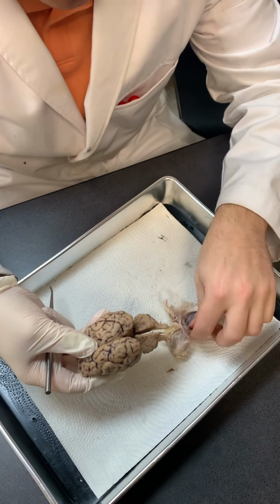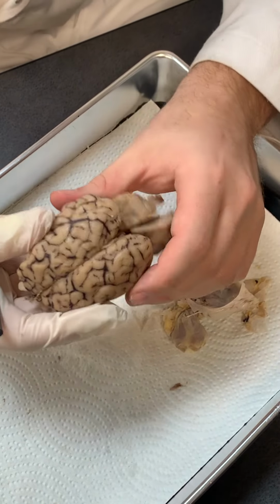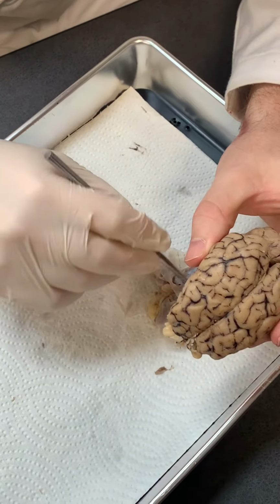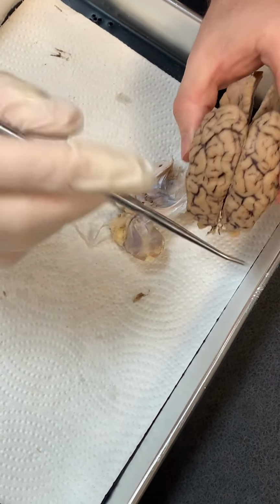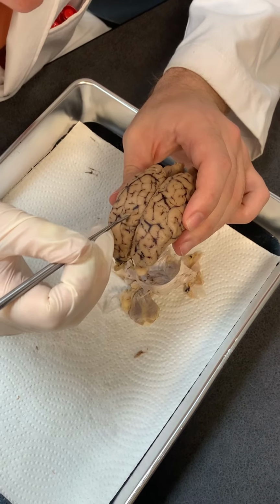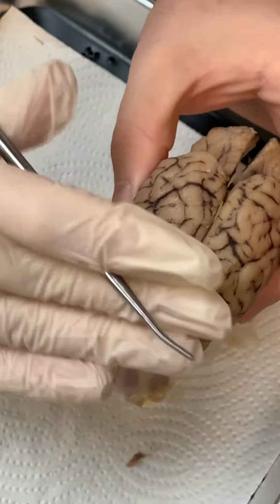Okay? Deep to the dura mater, so sitting right in here, is going to be a cobwebby layer. That cobwebby layer is the arachnoid mater, or you can just call it the arachnoid layer of the meninges. That's going to sit on the inside of the dura mater. And then really connected to the brain itself, we have the pia mater. If you look closely on here, and I don't know if it'll even show up in your video, it's what is giving this brain its shininess right now. That's that little thin membrane, the pia mater.